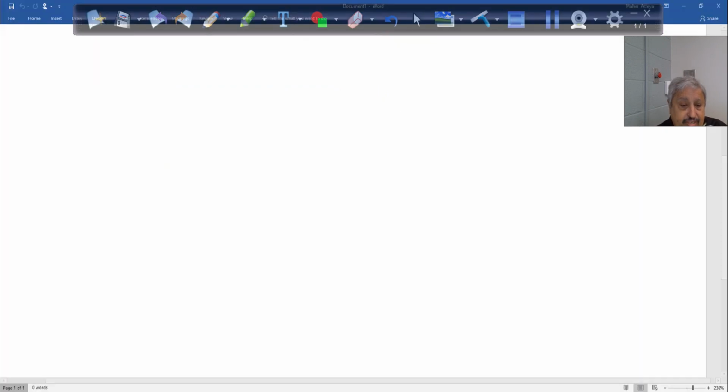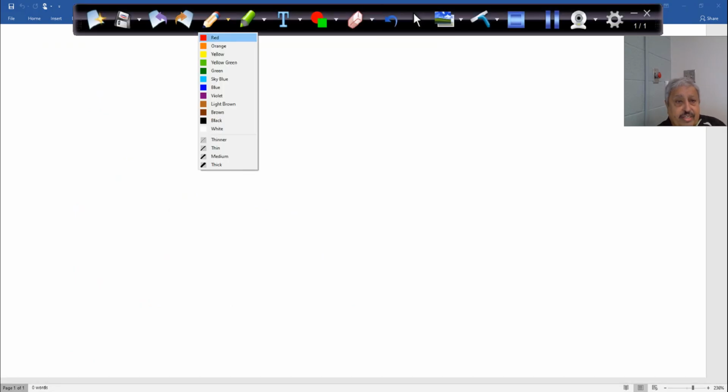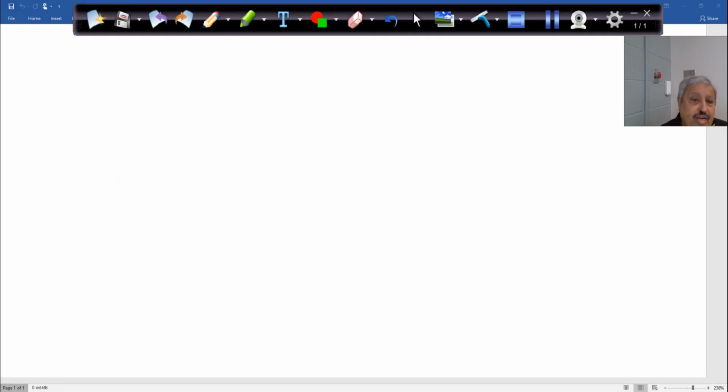So, the experiment itself is straightforward. You can see the experiment is straightforward. So you will have a stand, correct? You will work in the hood, and today you have to keep your goggles all the way on your eyes, because you are heating what?